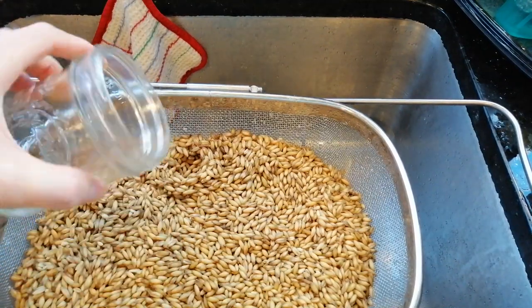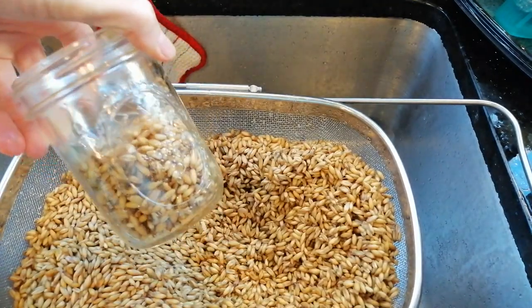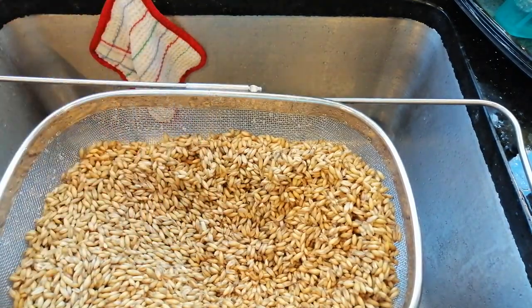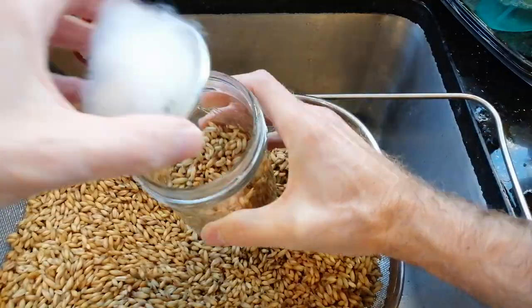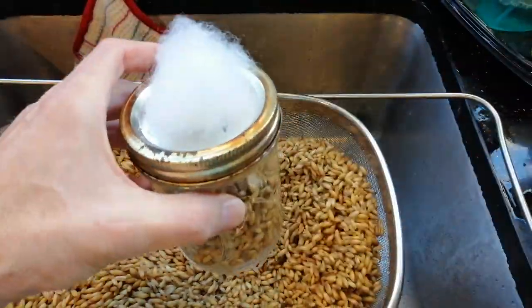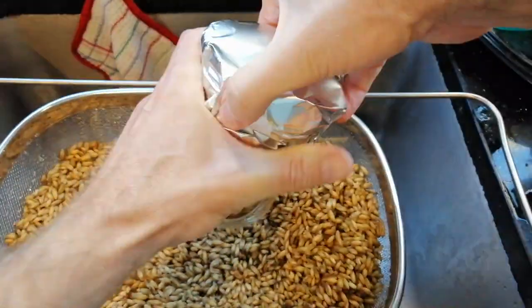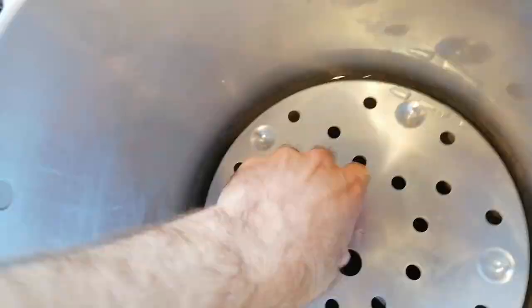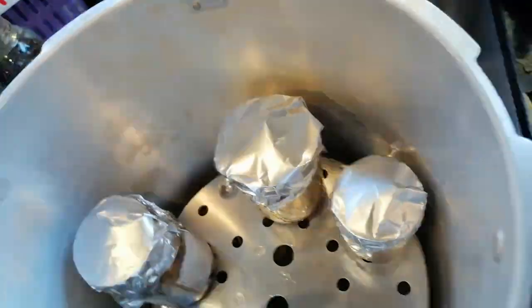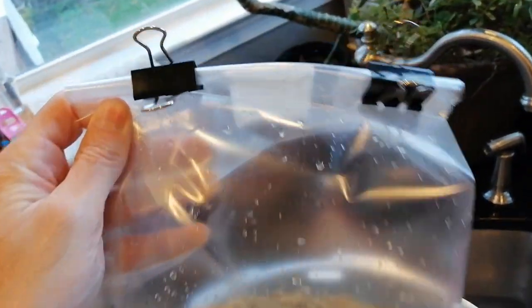Fill each jar just a little bit more than halfway. This is because the grain will expand a little bit when you pressure cook it. Also, you need a little bit of extra room in there for shaking the grains later. Add your filter lid to the top, then add the ring and cover with foil. Make sure you have plenty of water in your pressure cooker, then add all of your grain jars. If you have myco bags of grain, you can add those as well.